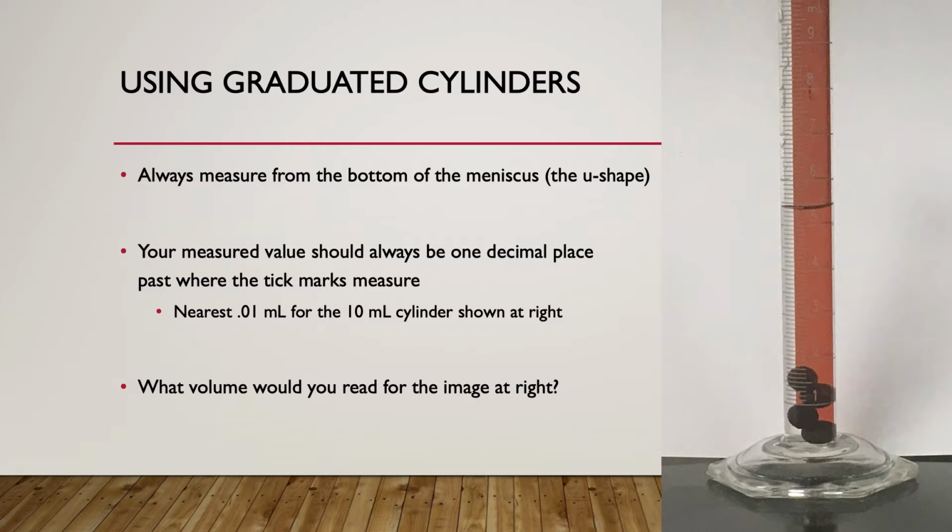What you're going to do to find the actual volume is add a little bit of water to your graduated cylinder. If you have just water in here, let's say your volume is exactly 4.0 milliliters, or 4.00 milliliters. You're then going to add your metal spheres, or just the solid that you want to know the volume of, and see what the new volume of the water is, how high it has risen. You take the change in the volume, because the change in the water volume after you've added your solid should just be the volume of the solid itself.